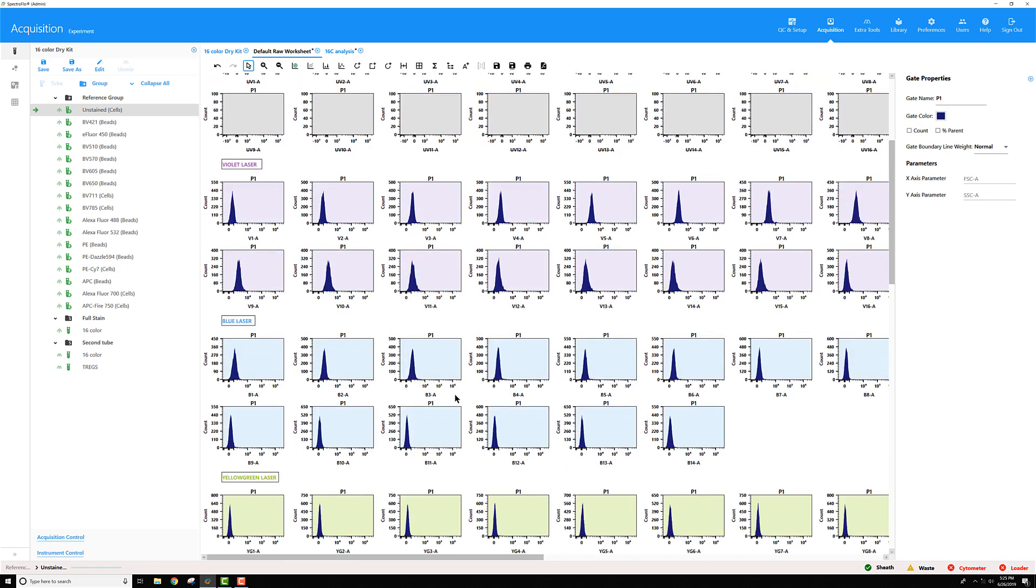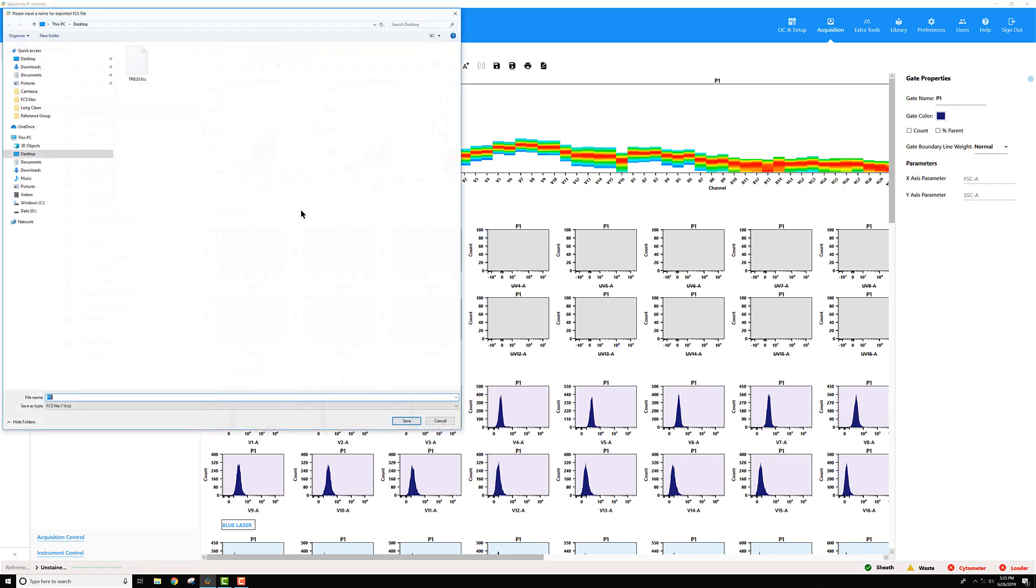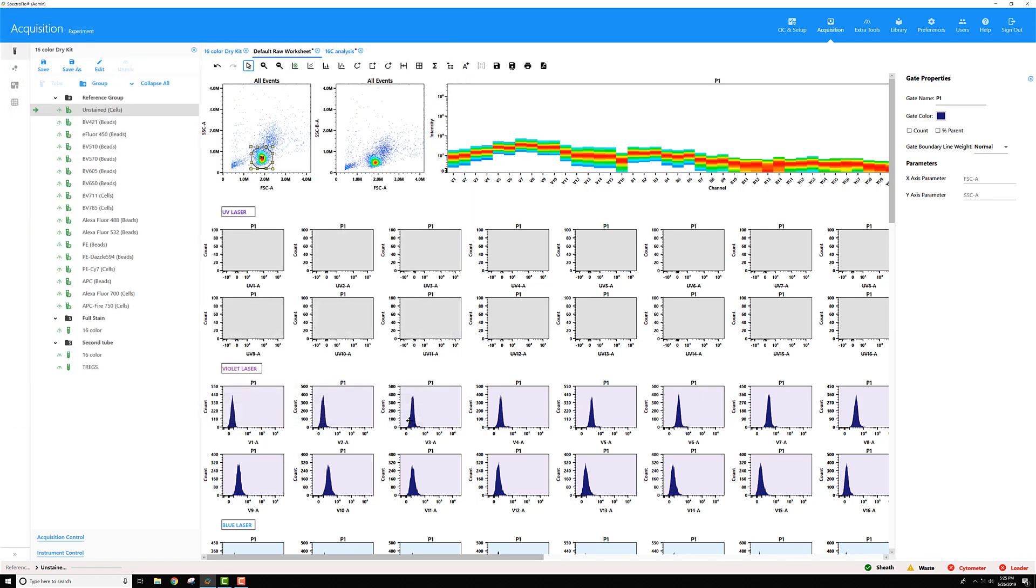Maybe what I want to do is export P1 by itself. Again, I'll right-click on the gate, select Export Gated Events as FCS File, choose where I want to export it, and give it a name, and click Save.